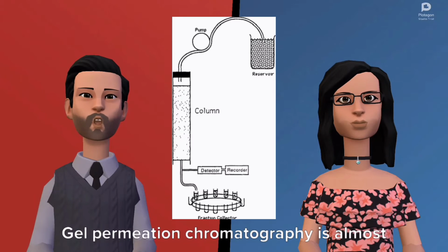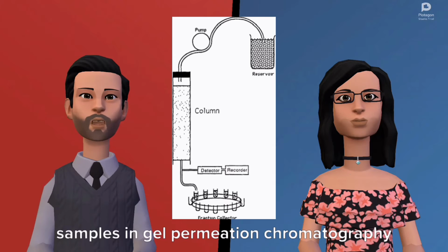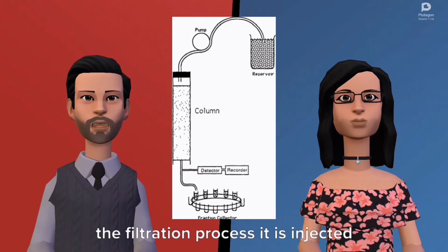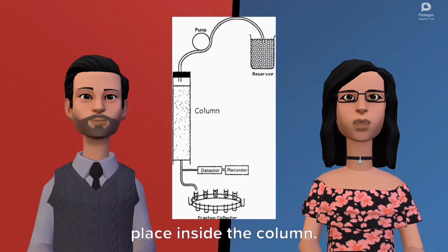Gel permeation chromatography is almost similar to liquid chromatography. Just like in liquid chromatography, samples in gel permeation chromatography are also first dissolved in solvent, but in this case the nature of the solvent is specifically organic, and after the filtration process it is injected into the column. The separation process basically takes place inside the column.